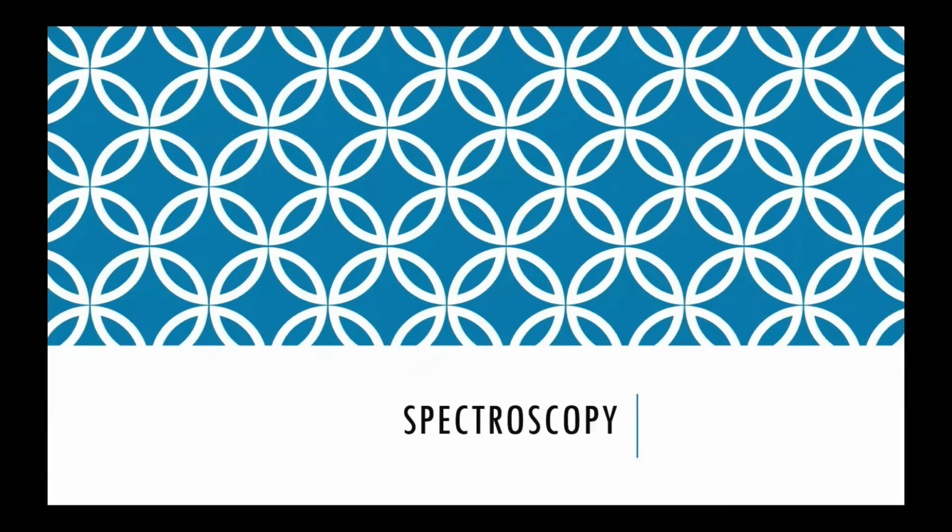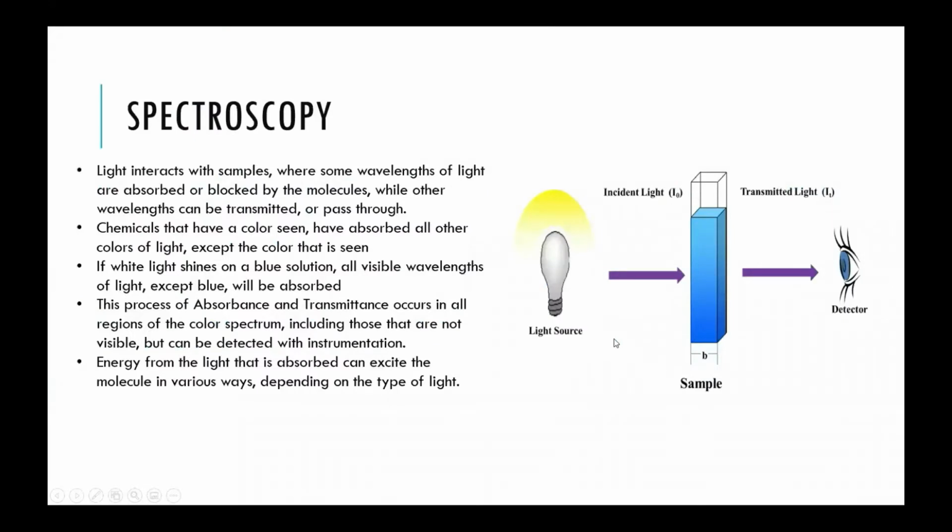Light interacts with everything from different solid objects to chemical solutions. And it's this interaction of light with different chemicals that is the study of spectroscopy. Spectroscopy is when light interacts directly with chemicals, either in chemical solutions or objects.